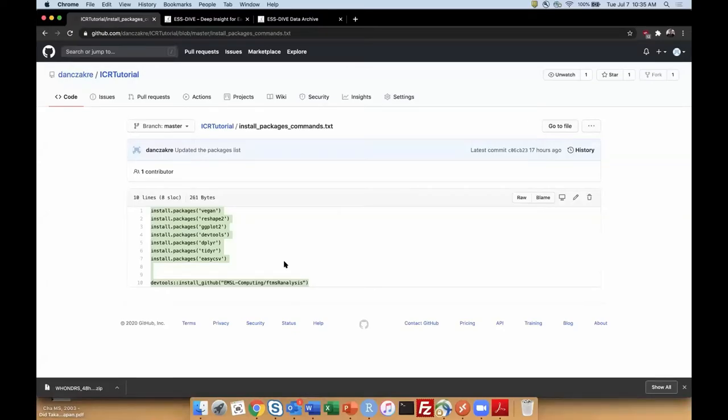It could be that they do contain the elements that we know, but they didn't fit our user-defined filter. We actually have a very liberal filter in that regard. When you go beyond that filter, you might start getting incorrect formula assignments, so the false positive rate goes up significantly. So there are a lot of reasons why a lot of molecular formula aren't assigned.